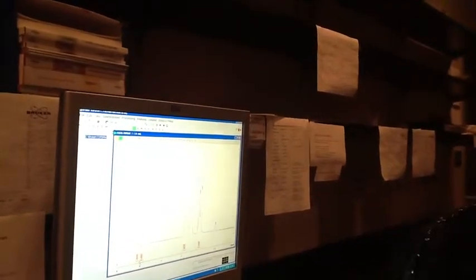The same carbon is attached to two others, and only one hydrogen, right? So that's why it's integrated to one. That's the one that's next to the most electronegative, because of the dipole moments. What's beside it? You tell me. Is that the Br? Would you see Br in a proton spectrum? No, just hydrogen. Well, is there a hydrogen right next to the neighboring carbon?